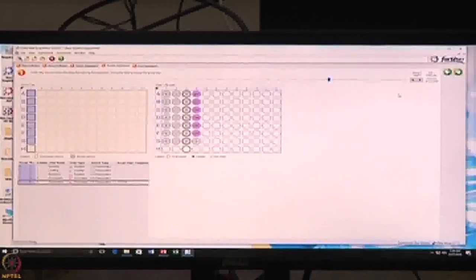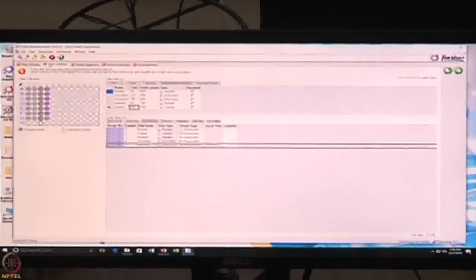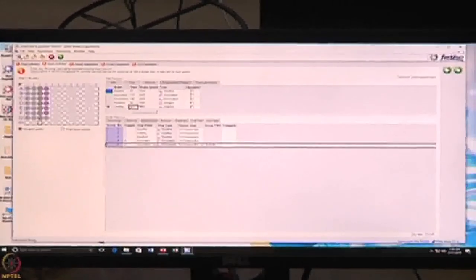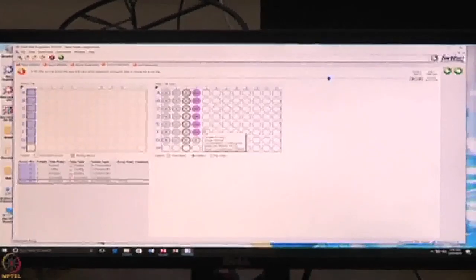So that's the actual real time that it's doing all those steps? Yes. It seemed to go very fast. Yeah, it's a program. It just dips very quickly, that's all it needs to do? Yeah, based on the timing here. This is the review prior to the experiment, where we check whether my experiment setup is fine or not. These are the timings I provided here.